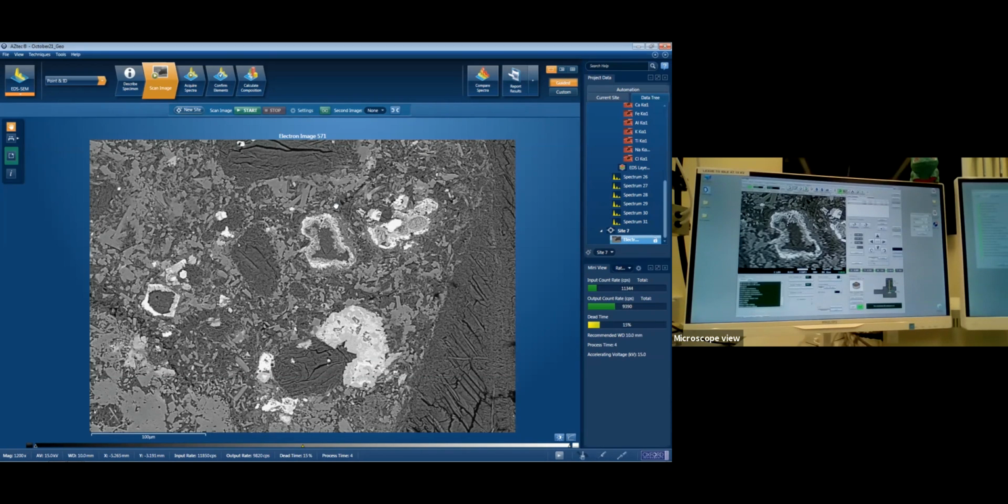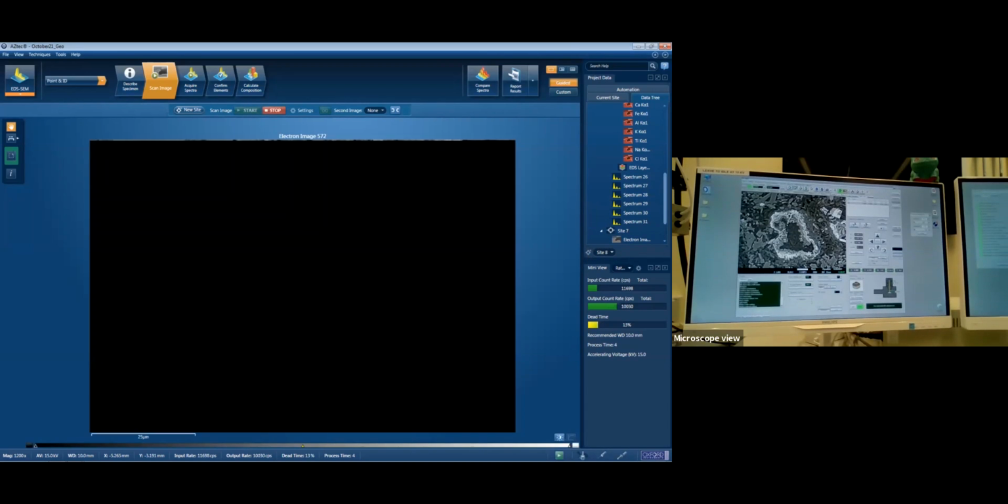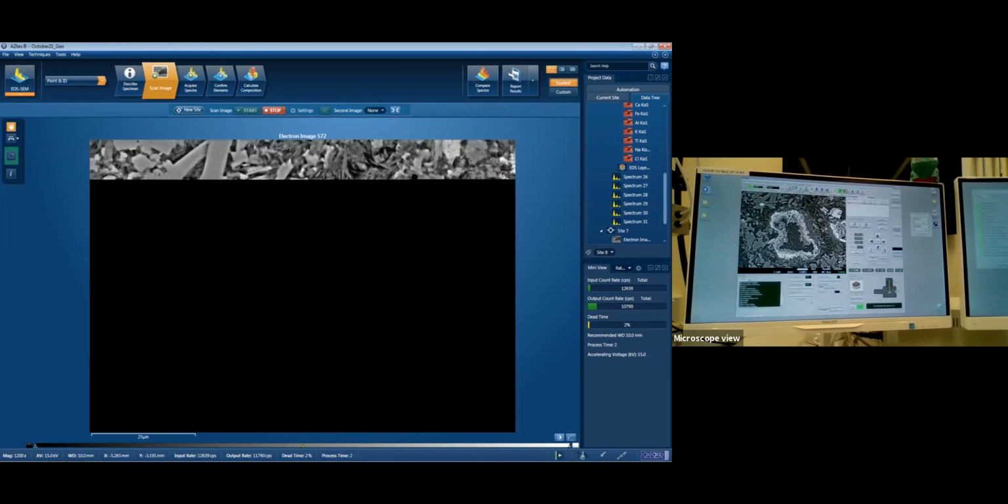That's quite a lot for Jonathan. That is quite a lot. Cool. Look at all those funky textures. Yeah. Cool. Lots of cubes.